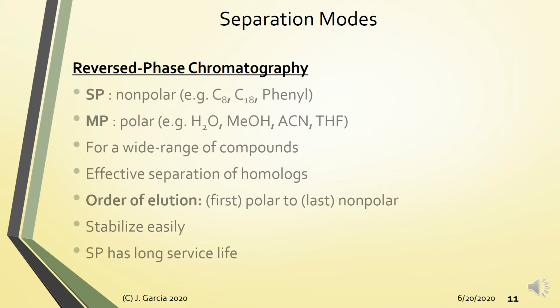Okay, one advantage also of reverse phase chromatography is that it has a long service life, no, as long as you follow the operating conditions, no, like as much as possible, do not use this at high pH. Okay, never drop the column because this will create gaps in the packing. All right, what else? Never let it dry up. Okay, nasa mga ganong klaseng protocols.